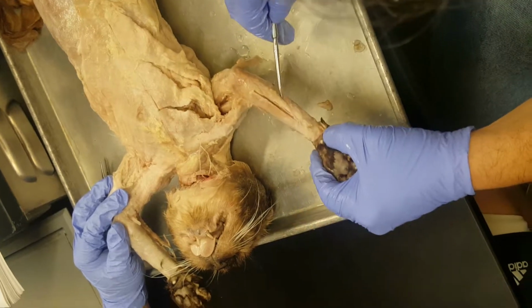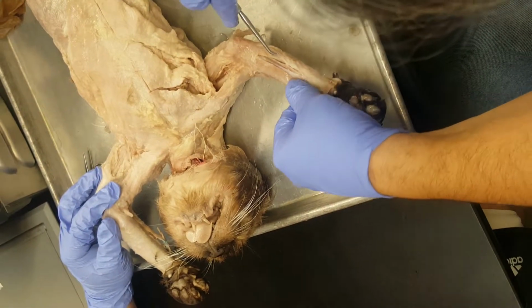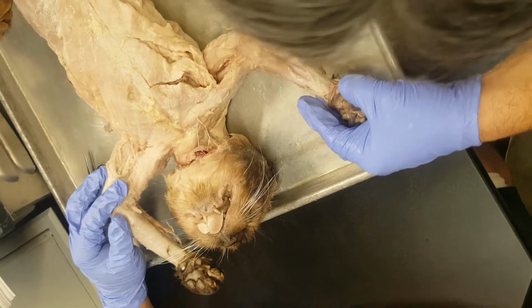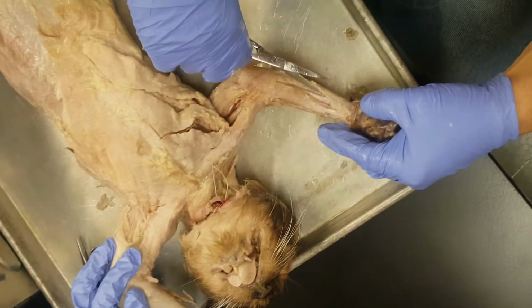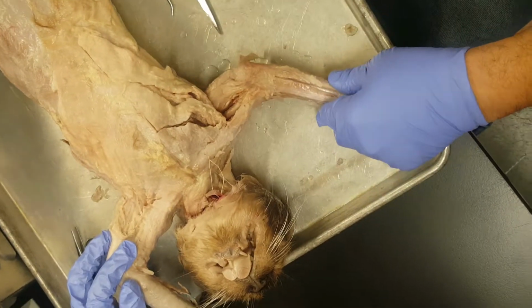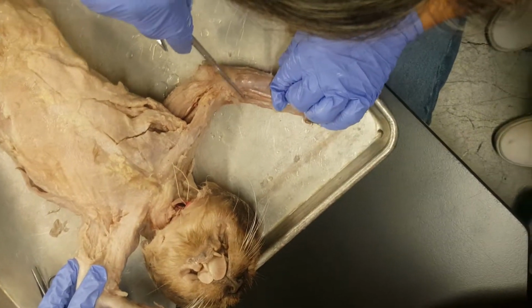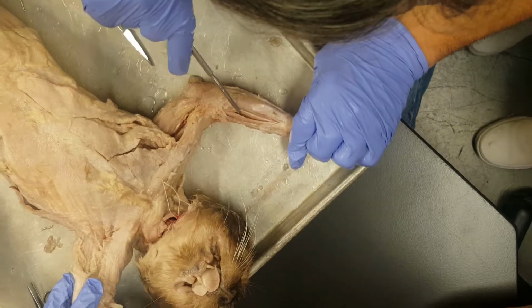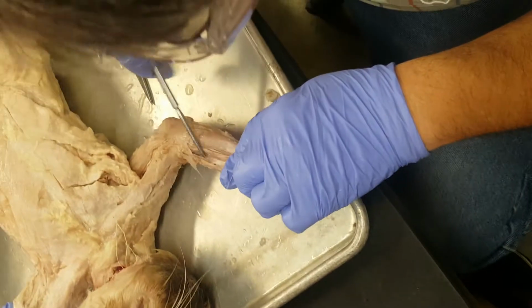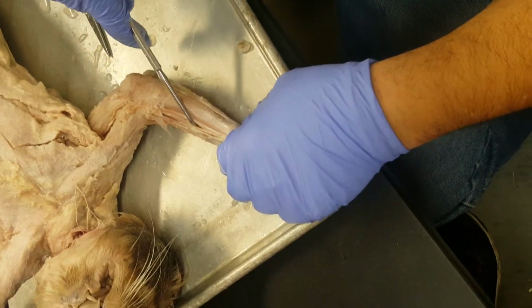Then this is your flexor carpi ulnaris, if I can get it. Get it out very well. Start over here. There's your pronator. Let's see. Get them organized here, guys.